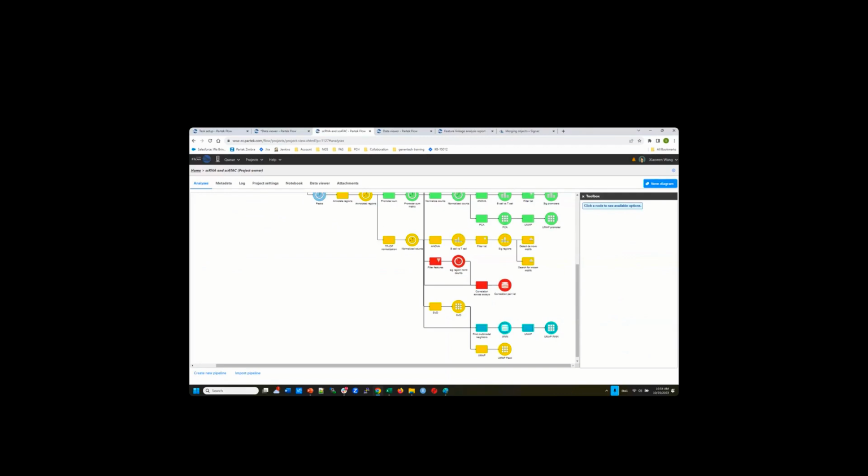Another way is, just like when we do bulk RNA-seq and ATAC-seq analysis, if in every cell you perform 2 assays, we can perform a correlation. However, for single cell, because there are a lot of zeros, your correlation won't be good. That's just the nature of single cell in the current technology.